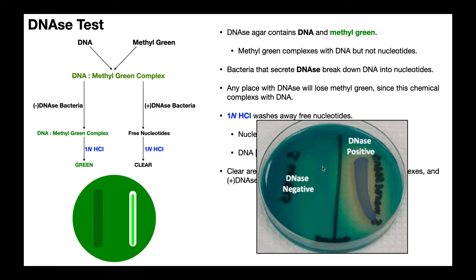Here's another look — this is a real-life DNase agar. Over here on the left, this is still DNase-negative. It's hard to even see where the streak was, but there's no clearing around it, no halo — clearly a negative species on the left. Over here on the right side, this is clearly a DNase-positive organism because around that streak I can see a zone of clearing or halo where you don't have that green color. Again, the DNA has been broken down by the DNase and the nucleotides produced don't complex with the methyl green — therefore the green color is lost. So if you see a halo or zone of clearing, that is a DNase-positive organism.